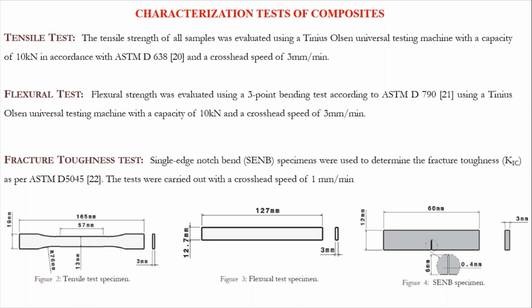The nanocomposites were characterized using tensile, flexural and fracture toughness tests to understand the effects of filler addition on the properties of the composites. Tensile, flexural and fracture tests were carried out in accordance with the corresponding ASTM standards by using the specimens shown in the figures.